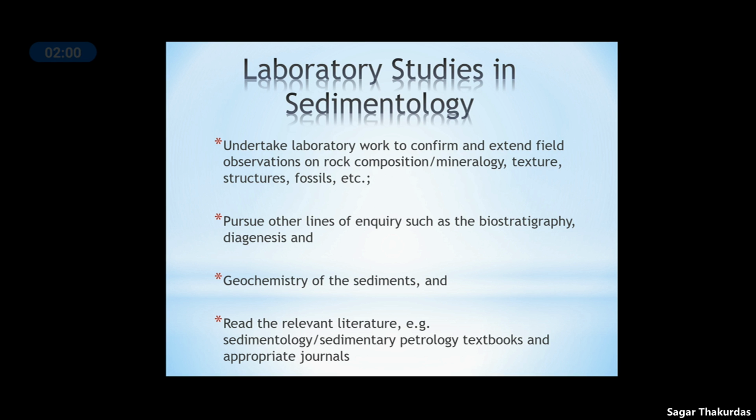So we undertake laboratory work to confirm or to extend the observations which are made in the field about the composition and mineralogy of the rock, the texture and structure, and also the fossils which are observed in these rocks. All these studies can be carried out in the lab in much more detail, and there are various methods of finding these aspects that we will see.